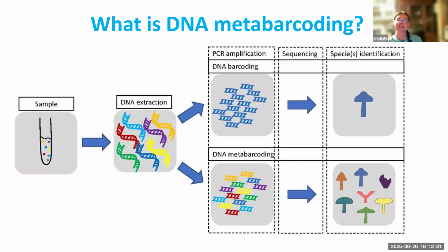Okay, so moving on to DNA metabarcoding. Traditionally, you're going to see 2 different types of descriptions here. You're going to see DNA barcoding, which again, barcoding is just another name for saying you're sequencing something to interrogate its DNA to find out what it is. And then of course, I'm also going to discuss how that compares to metabarcoding.